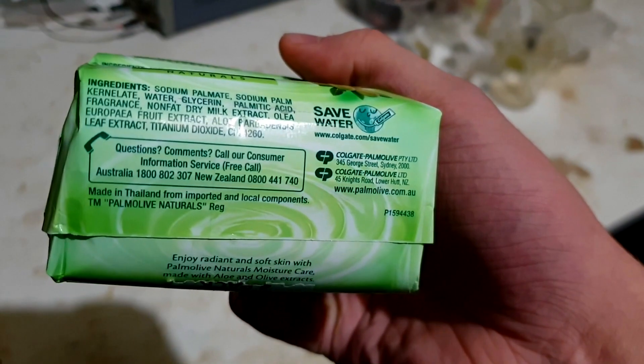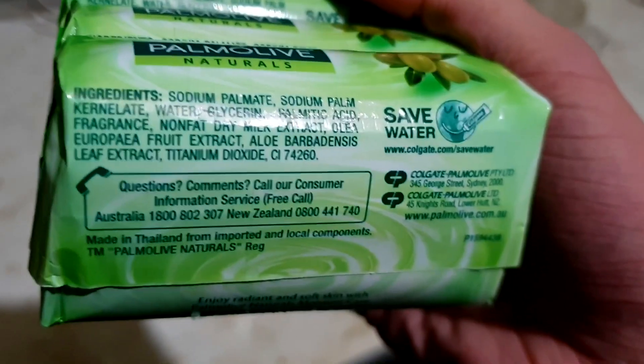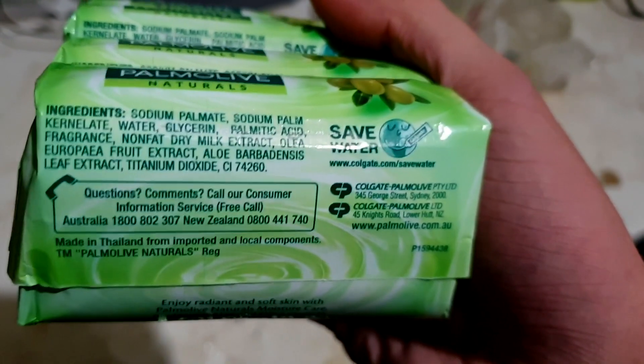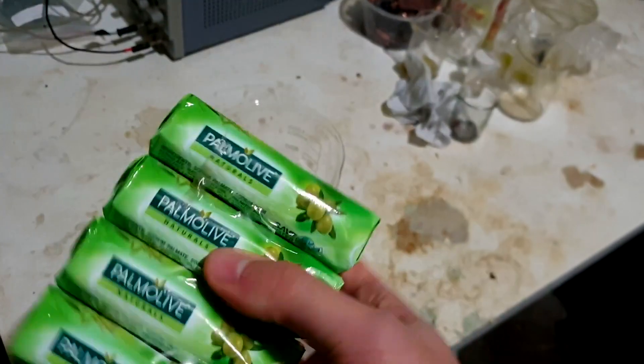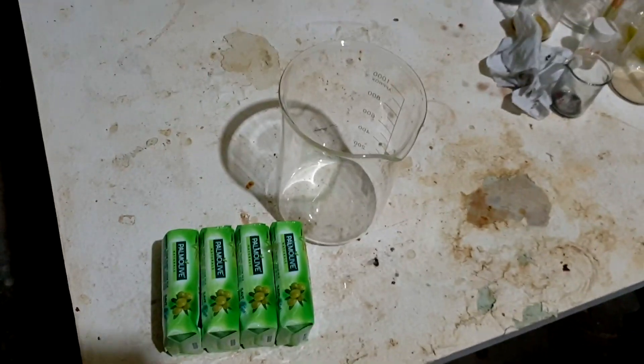We read the ingredients: sodium palmate — palmate? — sodium palmate, sodium palm kernelate, don't really know this one, water, glycerin, blah blah blah, palmitic acid. We are going to dissolve a whole lot of this in water. I reckon two blocks should do — what are they? 85 gram blocks. So we'll get some hot water going.